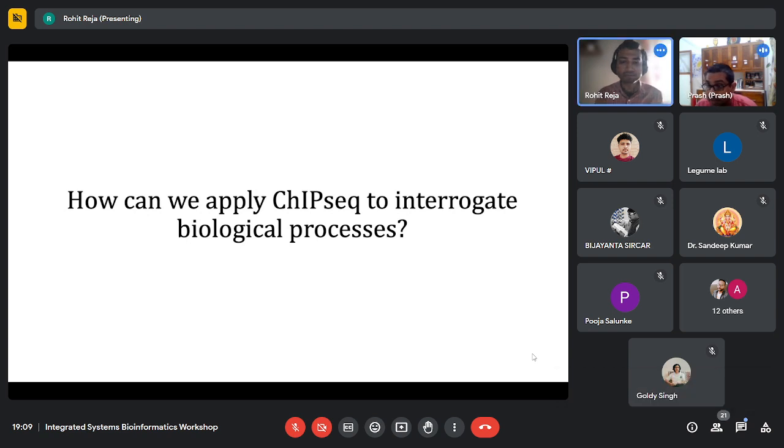Okay. Can I ask one question, Rohit? Yeah, sure. Wonderful talk, Rohit. So I was just wondering, looking into the open chromatin elements and their propensity, can we assume that the greater the girth of that particular open chromatin element graph, the greater the chromatin content present in that particular sample? Is that how we look at this figure that you were showing earlier?